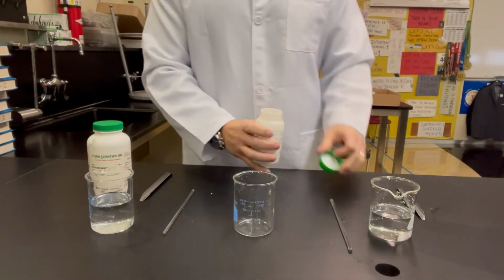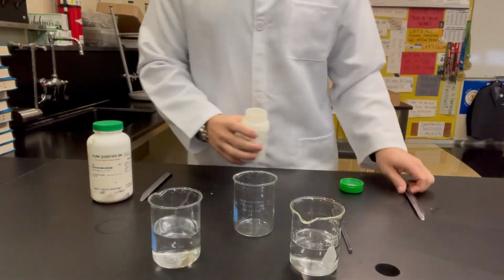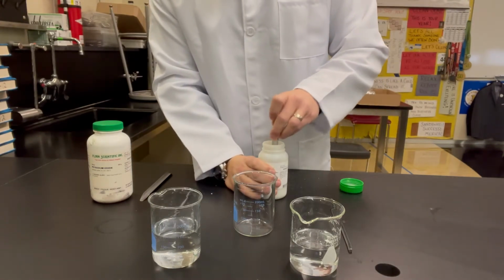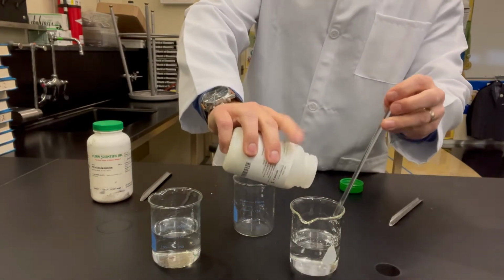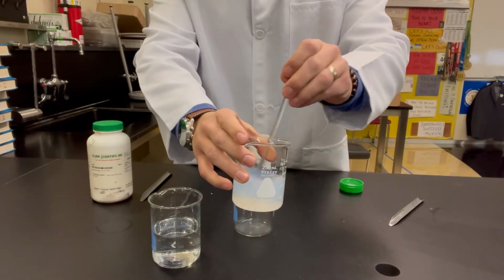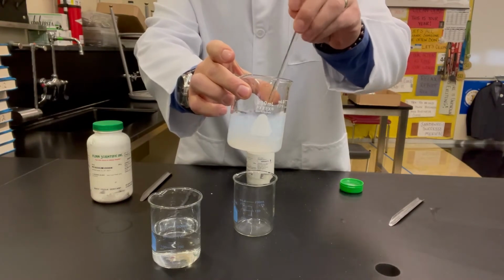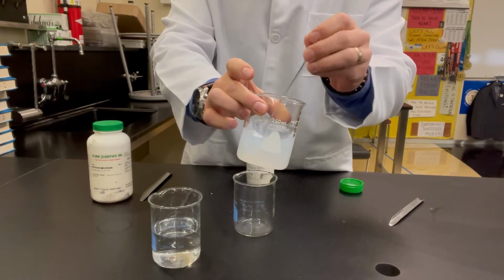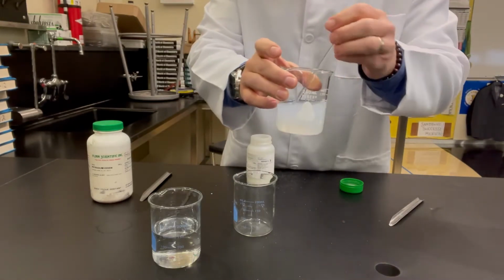So what I want to show you first of all is that I just have beakers of simple water here, but I'm going to take some of this lead 2 nitrate, and I'm going to dissolve it into the water. So it's a powder, but as I mix it up in the water, you're going to see that it's going to eventually dissolve. The water will be a little bit cloudy, but it will dissolve. Now, when this happens, we say that this compound is in an aqueous state.